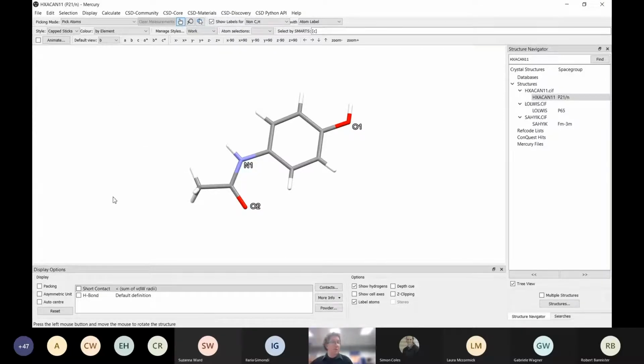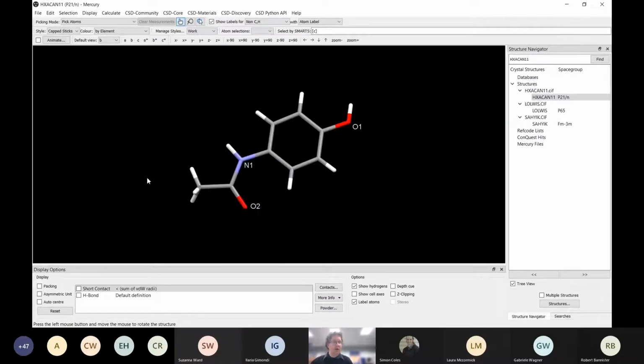Since I'm using white for the presentation, and a lot of white doesn't look good, I'm going to do draw backdrop, and we're going to go back to the black. So I've been doing a lot on this structure.